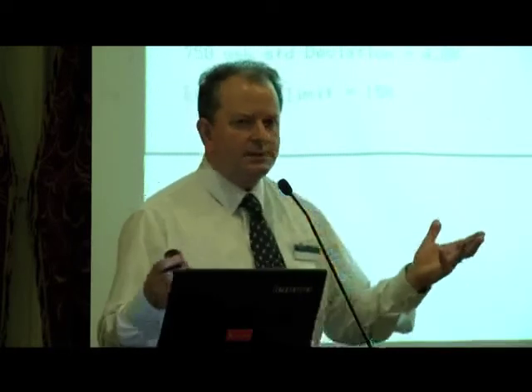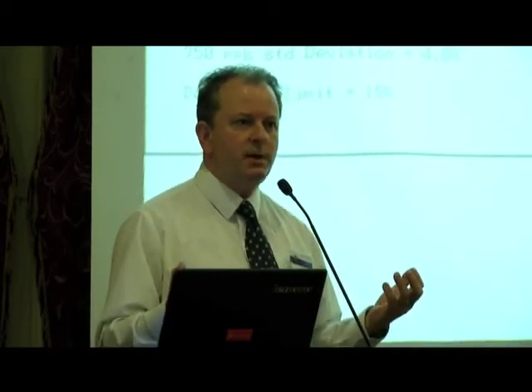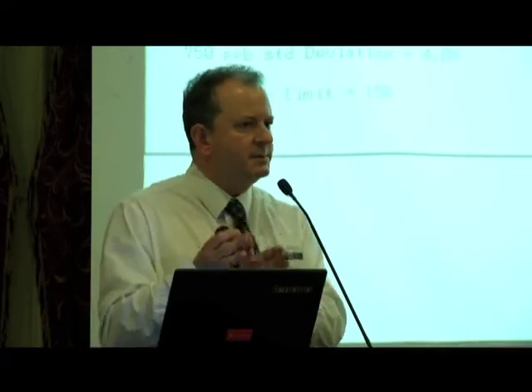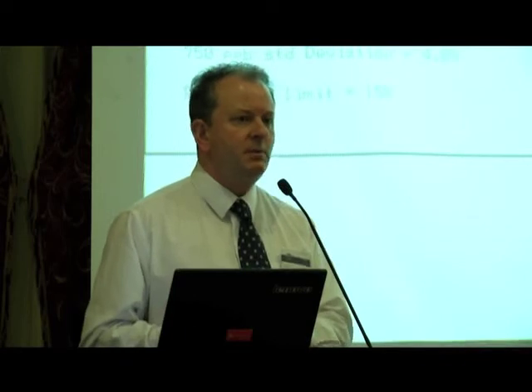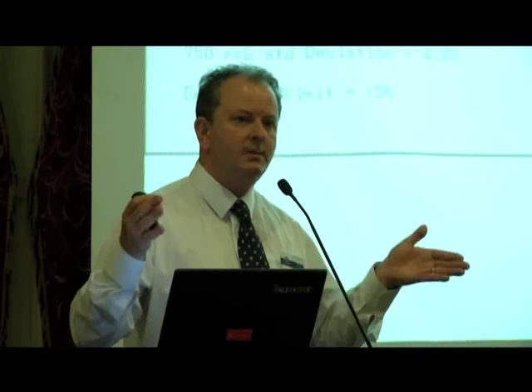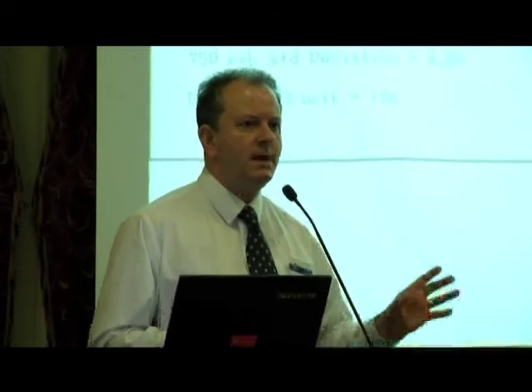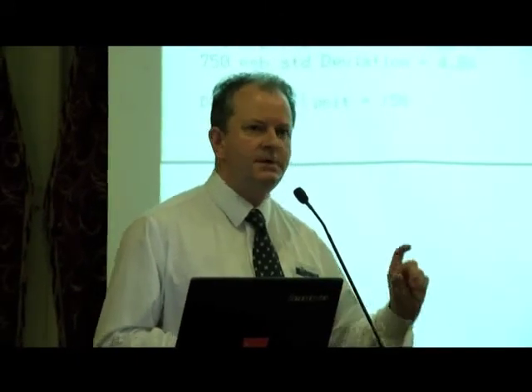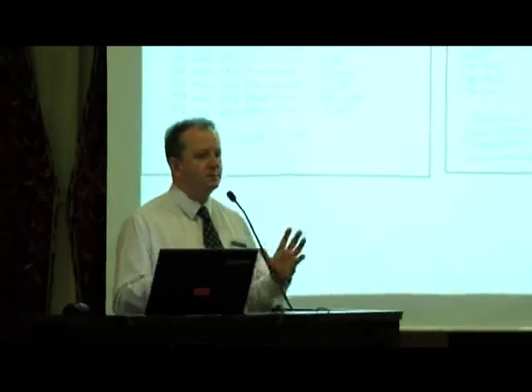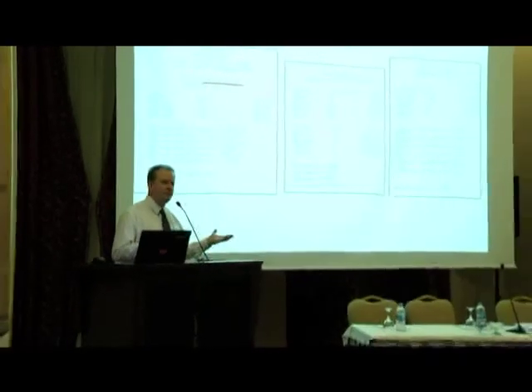So, our analyzer's online, it's reporting TOC. We are using the water for manufacturing, we are releasing products, and then we come to look at the analyzer. It's come up for its calibration cycle. The first thing we want to check is that the analyzer has been working correctly since it was last calibrated. So the first thing we do is an as-found calibration. We check the analyzer by running through certified standards to make sure that it is still within calibration and still working correctly, because we've been releasing pharmaceutical product based on this information.